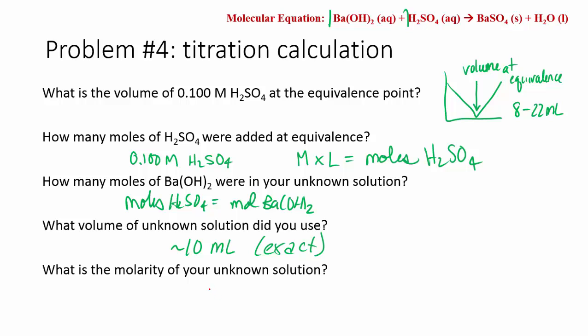And then the molarity of your unknown solution. Your molarity is your moles over your liters. So you found moles right here, your volume is right here, so you should be able to find the molarity of your unknown solution.